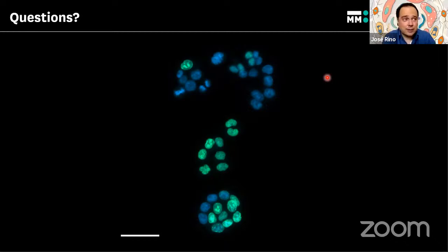Another reason is, like I told you, that the optical sectioning ability to remove out-of-focus light is different on the spinning disk and on the point scanner. The point scanner excels for a fixed sample, but that was intravital imaging, so the whole liver was filled with fluorescent cells.